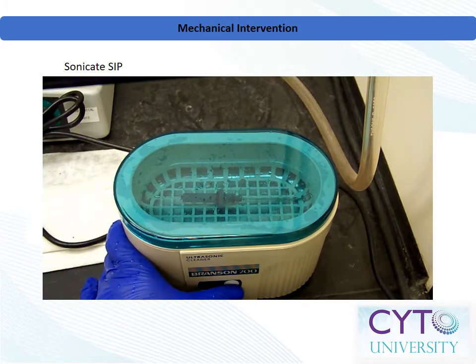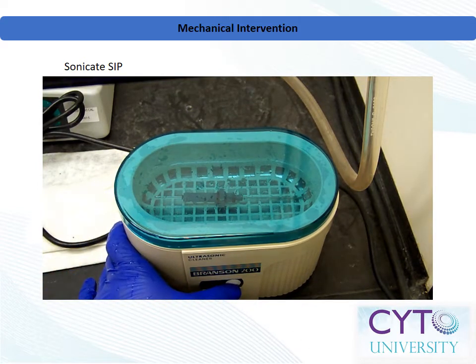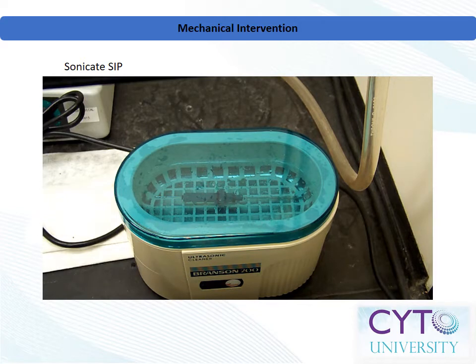First, try sonication. Immerse the entire inner sample injection apparatus in a water bath sonicator and sonicate for 30 seconds or more.